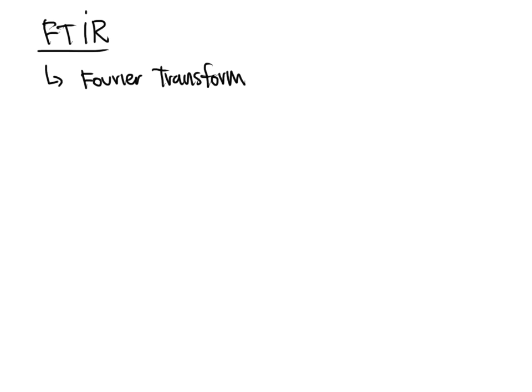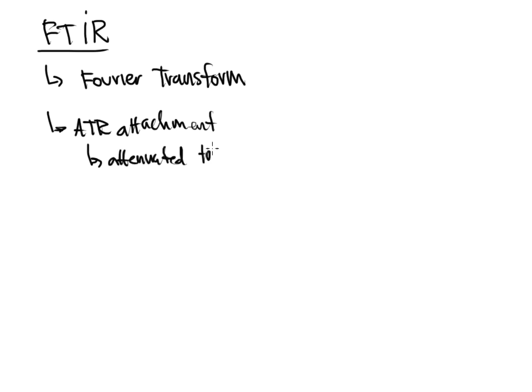So Fourier Transform Infrared Spectroscopy is a quicker method that I can use for this purpose. And in addition to that, there is an ATR attachment that we have. And ATR is attenuated total reflectance. That's what that stands for. So I'm getting ready to describe that.